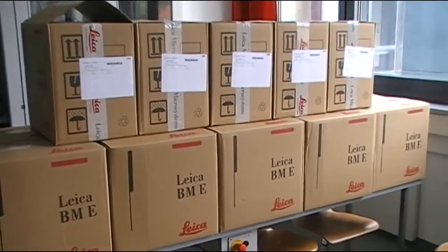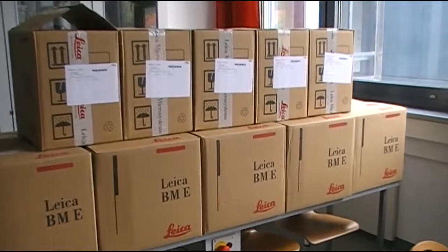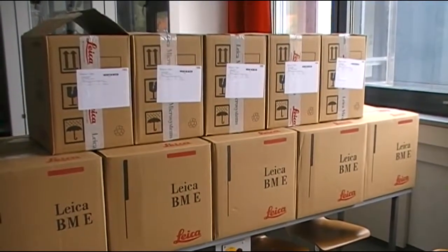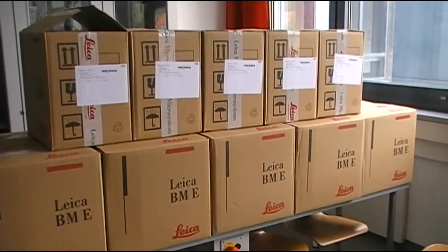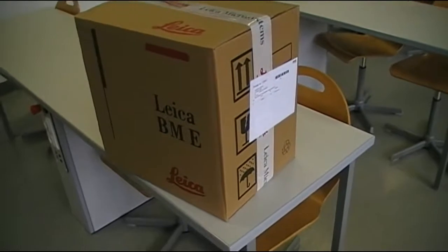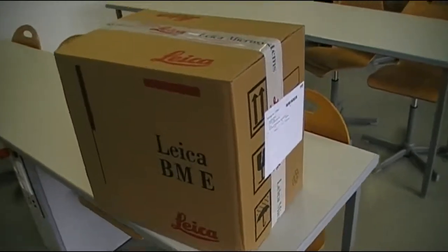We just obtained several new microscopes — new educational microscopes — and I'm now going to unpack one of them and have a look at the contents. Okay, here it is and I'm going to now unpack the microscope.